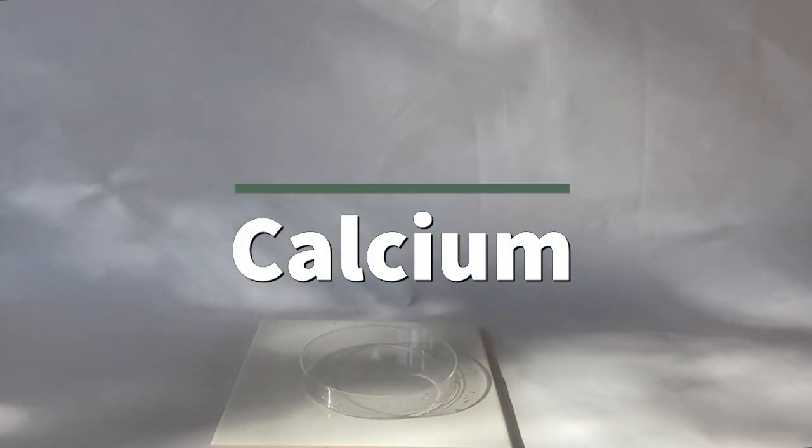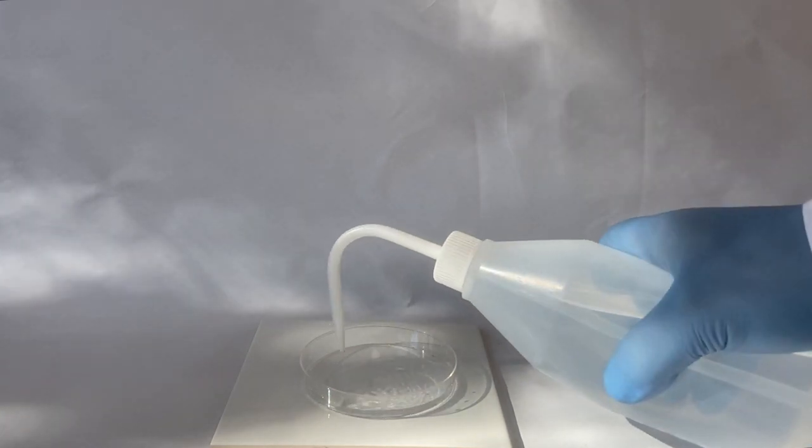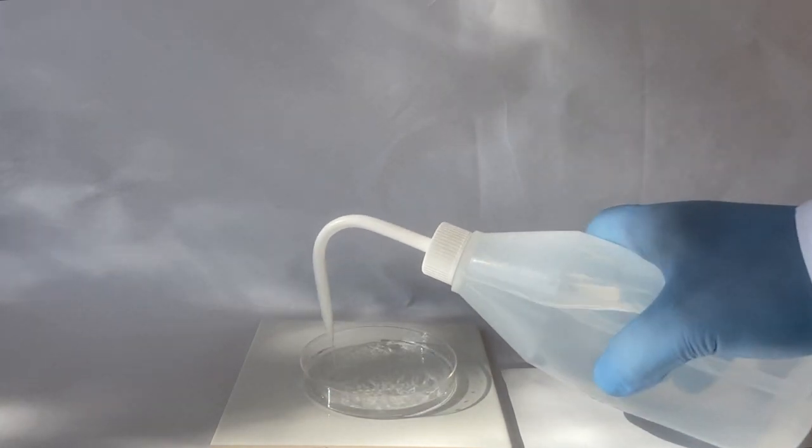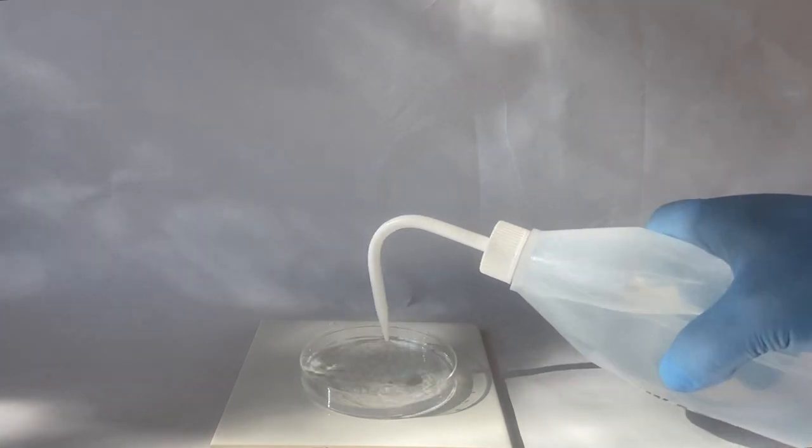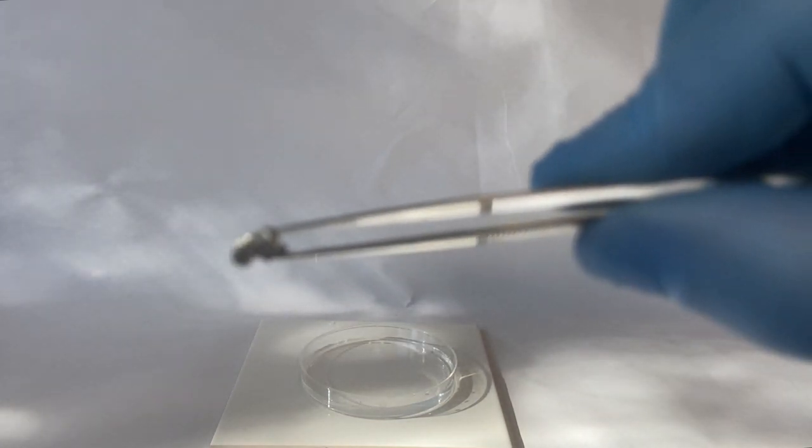The last metal for this lab is calcium. We're using the same setup with a petri dish and distilled water. Here's our calcium metal.